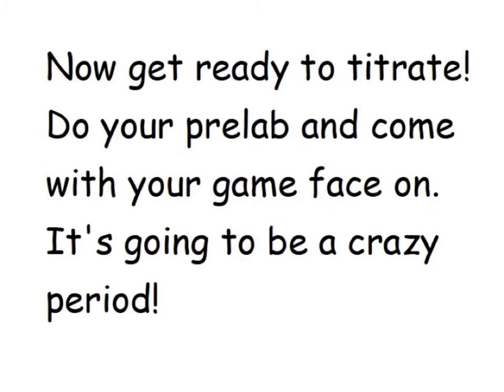Okay, so you are going to come in Monday. Be prepared. It's going to be really crazy. I'll be stressed out trying to get this all done. You're going to need to be doing teamwork: one's setting up the probe, and one's getting the acid ready and the burette ready. So you need to be using teamwork and divide and conquer.